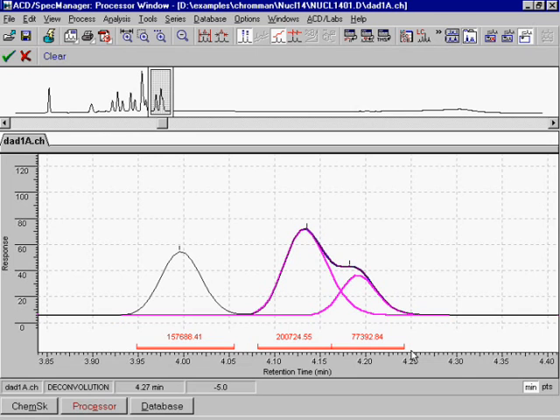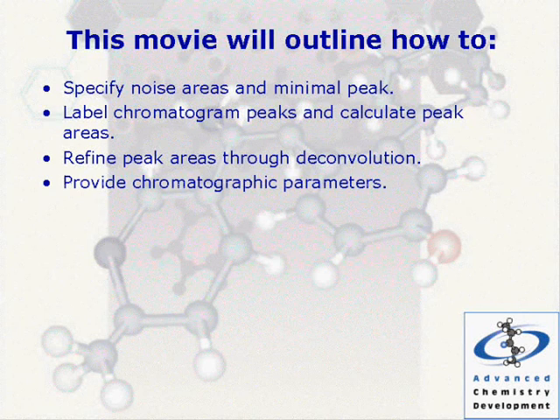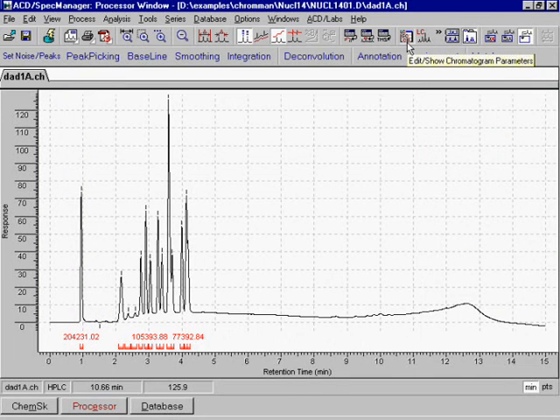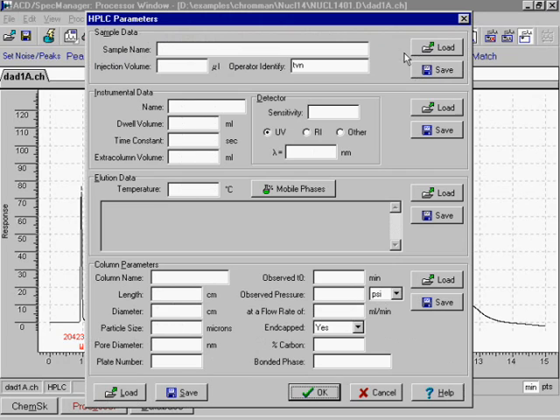Provide chromatographic parameters. With ACD Chrome Processor, you can load chromatogram parameters directly into your chromatographic document.